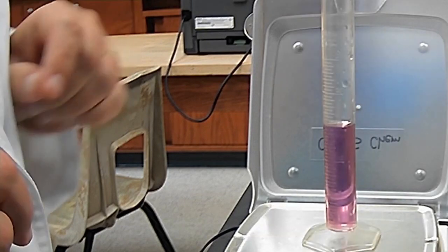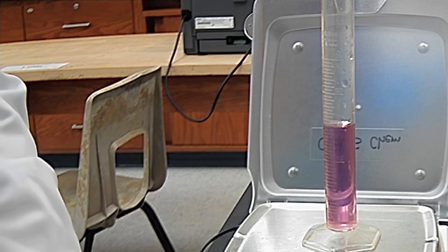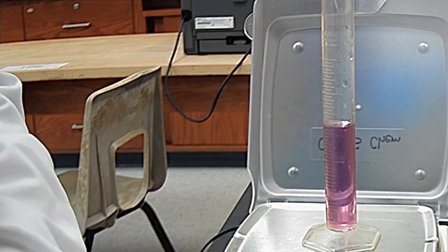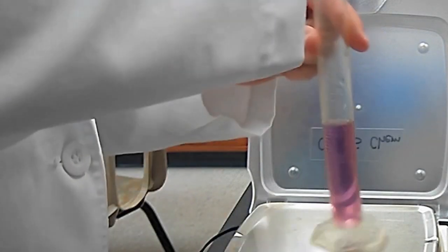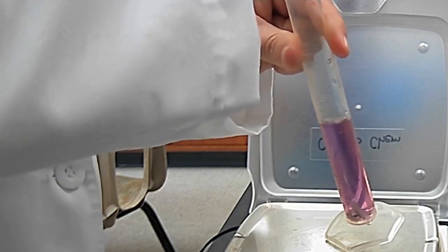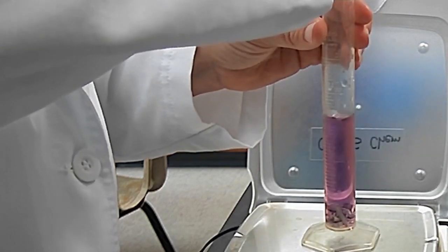So here's our next one, and its beginning weight is 28.9 grams, okay? And it should be 15 milliliters. Now we will add our sample, okay? So this is trial 2 for metal A. So now we're going to drop this in, and I'm making a slight mess. That's okay. And I have filled all these to 15 milliliters. I made sure it's all 15.